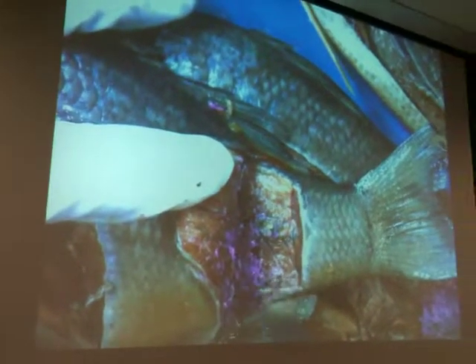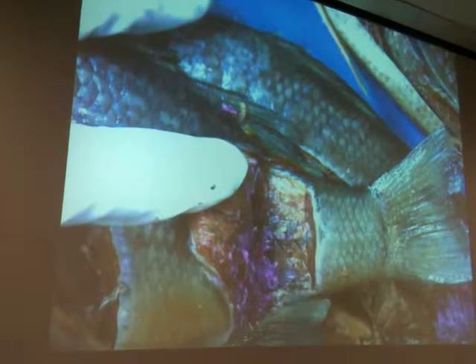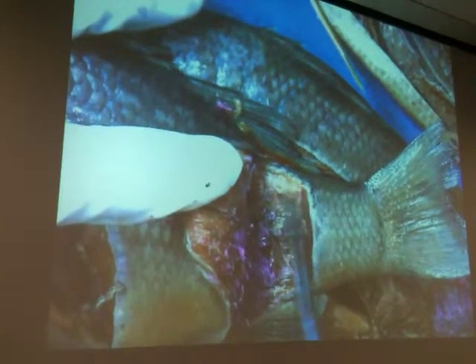So hypaxial myomere down here, epaxial myomere up here, okay?